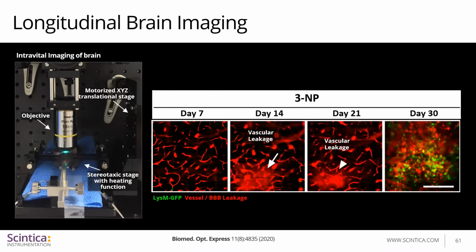To identify changes in vascular permeability, meaning that there is a blood-brain barrier dysfunction, longitudinal imaging was extended until 30 days after neuroinflammation.